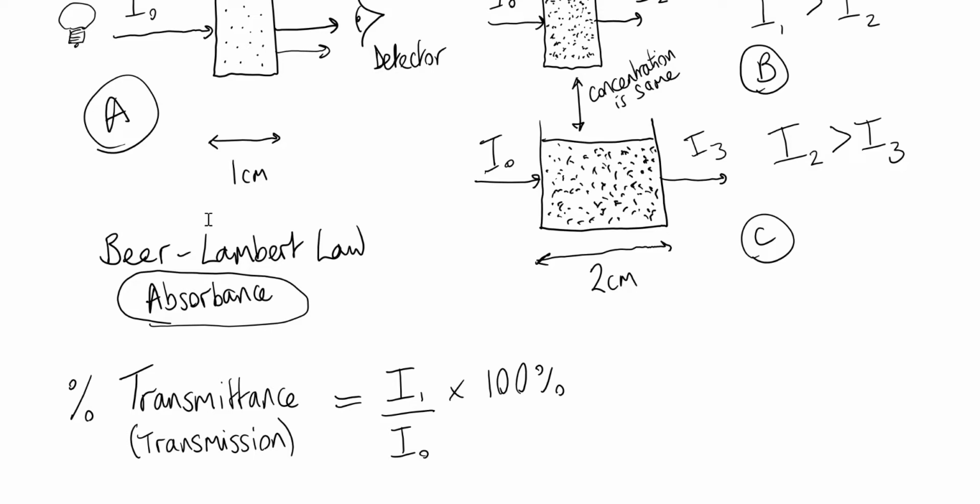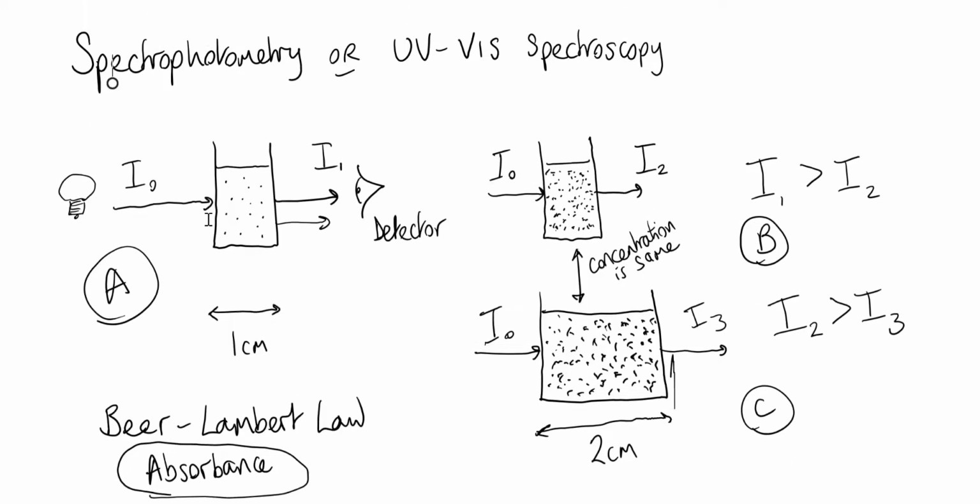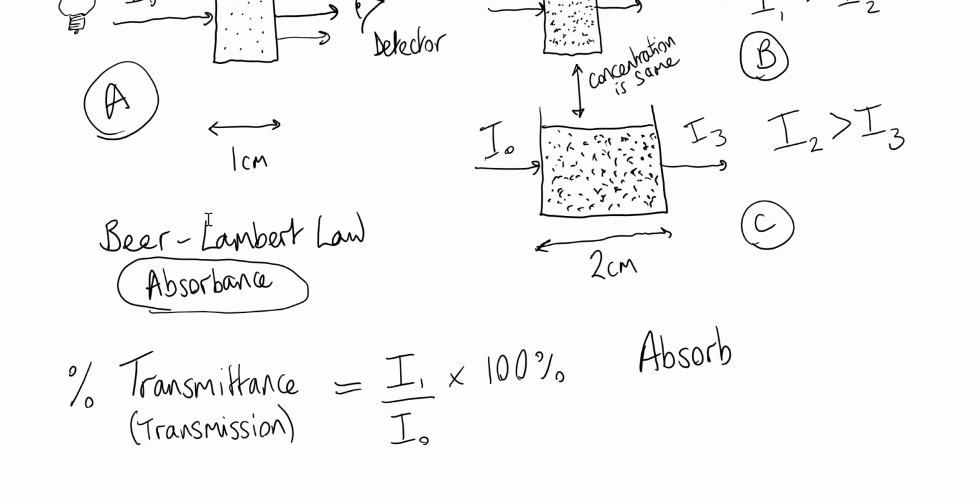The absorbance is the amount of light that's actually absorbed by the sample, and that's typically what we measure in the lab. So in fact, what we're going to do is bring all these things together, and first of all, define our absorbance as being equal to the negative log of the transmittance. So let's think about this for a second. If the transmittance is quite large, that means a lot of the light gets through, then the percentage transmittance is quite high, right?